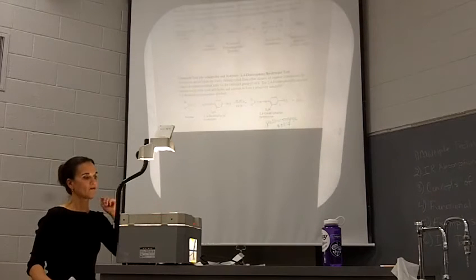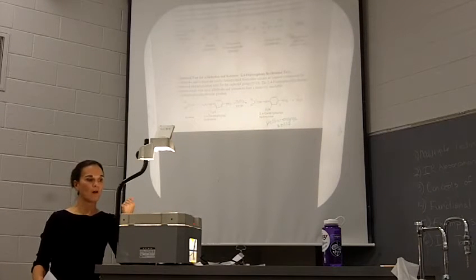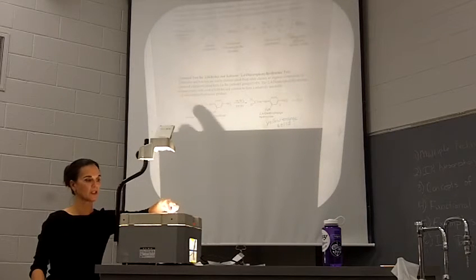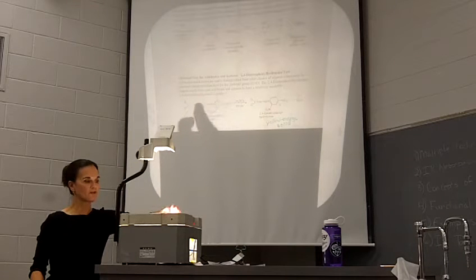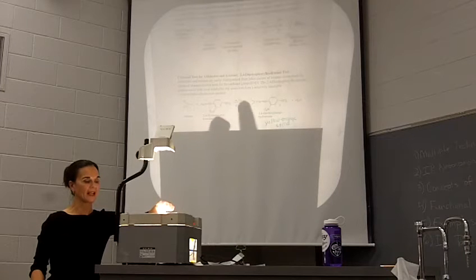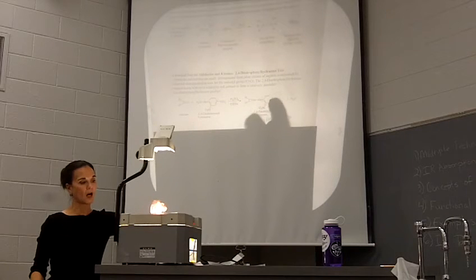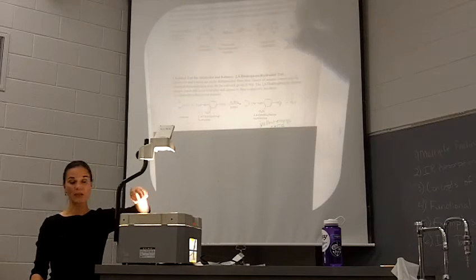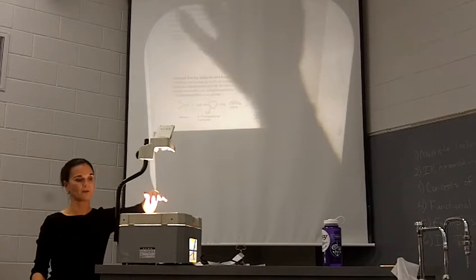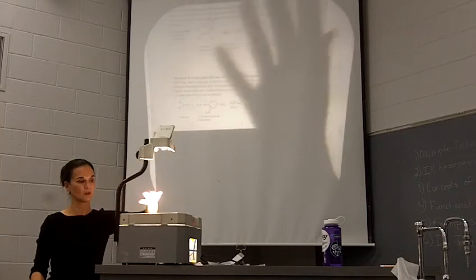For a ketone, we're going to use what is called 2,4-dinitrophenylhydrazine. So say we have a ketone here. This is our 2,4-dinitrophenylhydrazine, this big guy here. And it is in sulfuric acid and ethanol, so be careful with it. You don't want to get it on you. Wear gloves with it. And back to the bromine, keep that in the hood. You don't want to inhale any of the bromine or carbon tetrachloride fumes, so keep everything in the hood.